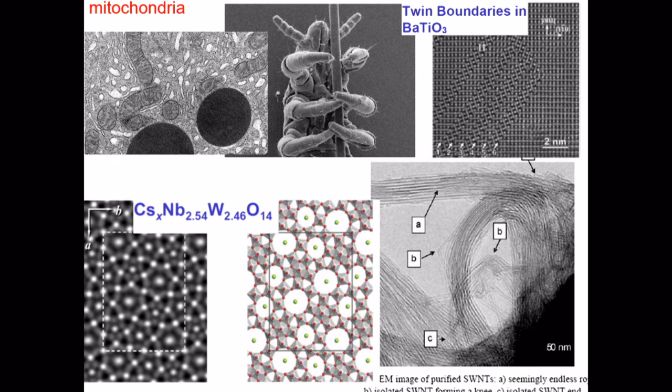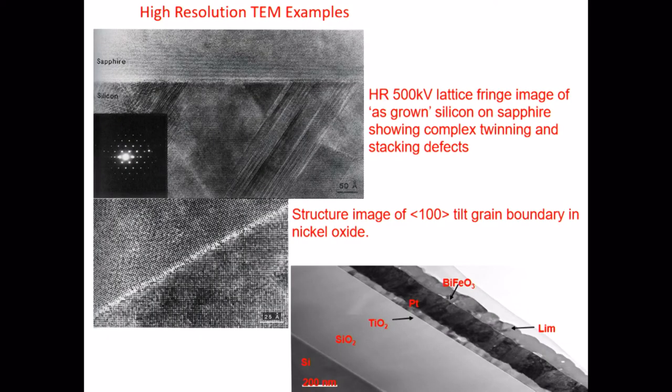This is a fiber, a single bundle of nanotubes. This is different layers, cross-sectional layers, again through TEM. This is high resolution and an electron diffraction image. With our machine, the Talos 200S, we can make imaging. We can study crystallinity using selected area electron diffraction. Like X-ray diffraction, we can have electron diffraction in this machine, the transmission electron microscope.